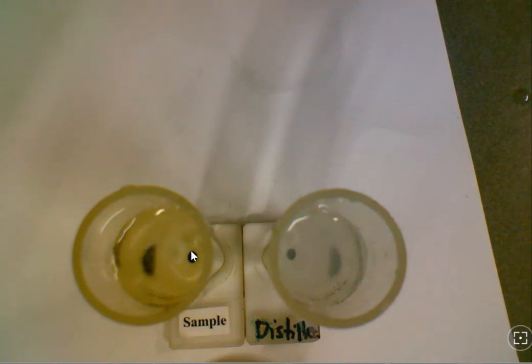today. Now if you happen to be sampling water and it rained the day before, or maybe there's a lot of erosion in your site, you're going to find that this is much cloudier, similar to what we did here. And if you read your instruction cards, there is information on how to actually measure out the JTUs for this sample. And to calculate the JTUs, you'll take the number of dropper fulls you add, and you'll multiply that by 5, and then report that number to your data collector.